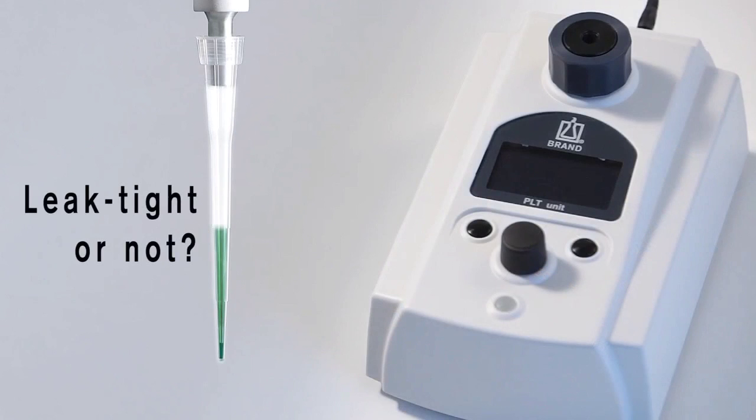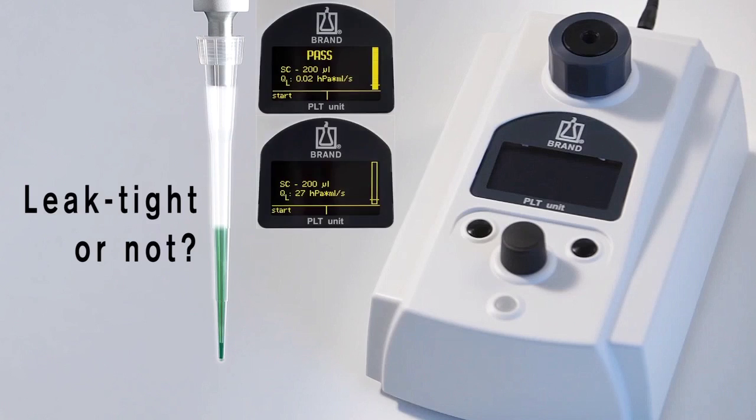Leaks are the most common cause of inaccuracy in piston-operated pipettes. When looking at a pipette that is not dripping, it is difficult to judge whether it is really leak-tight or not. The PLT unit from Brandt finds even the smallest leaks in just seconds and compares the missing volume with the tolerances in the ISO standard.